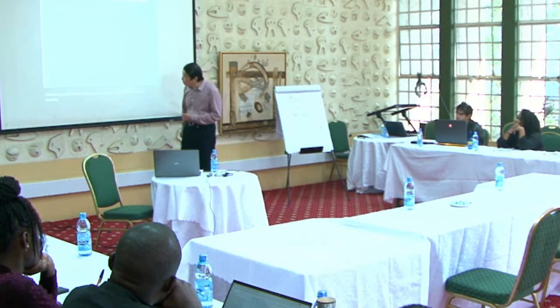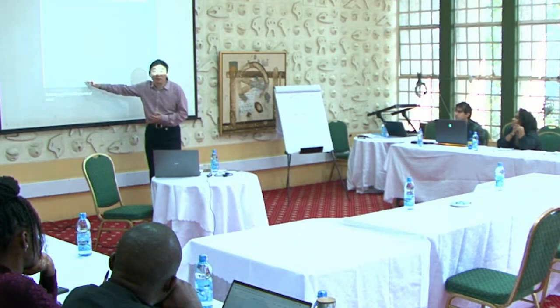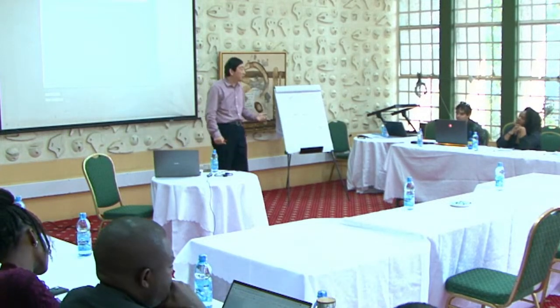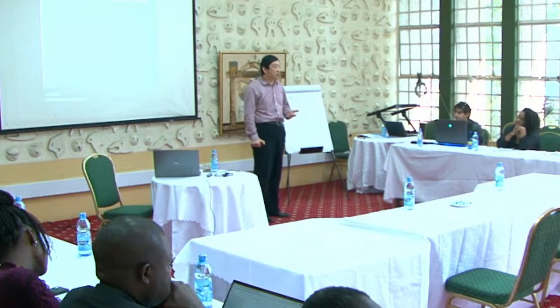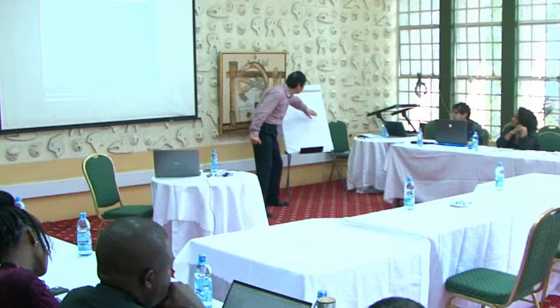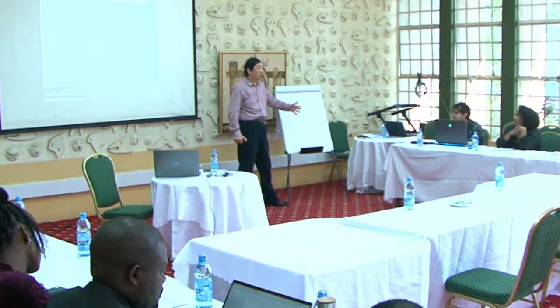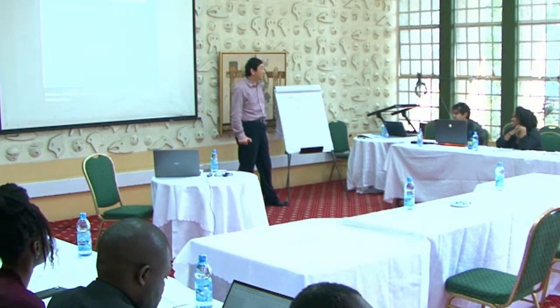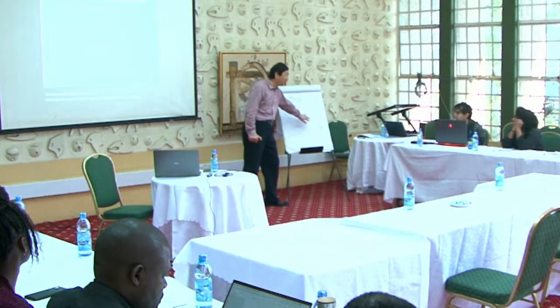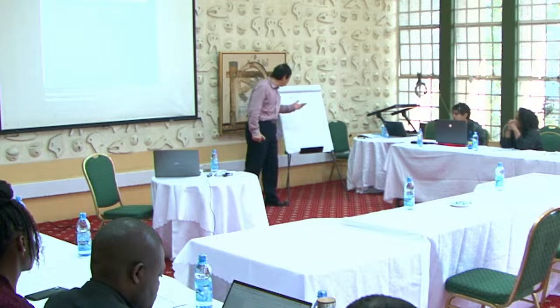So did you see 41, 42, 43, 40? You did not see a very good abundance of 43, so you can rule out this one. So it's probably linear. I'm pretty sure it's just this, 1, 2, 3, 4.